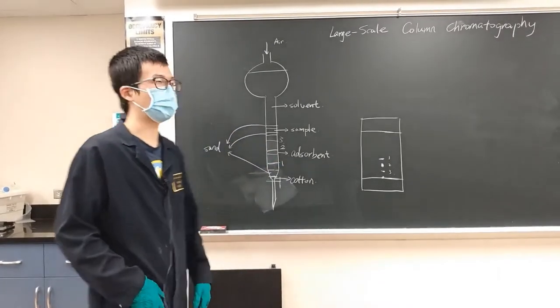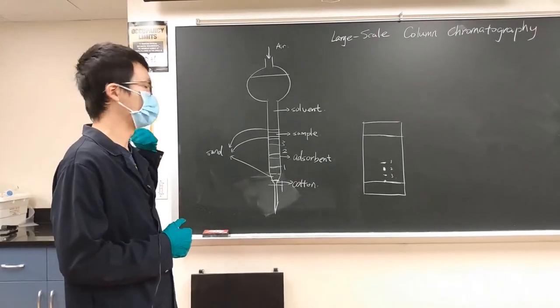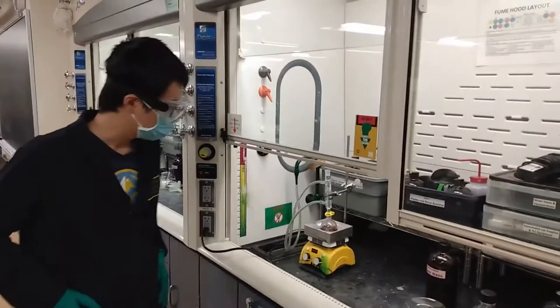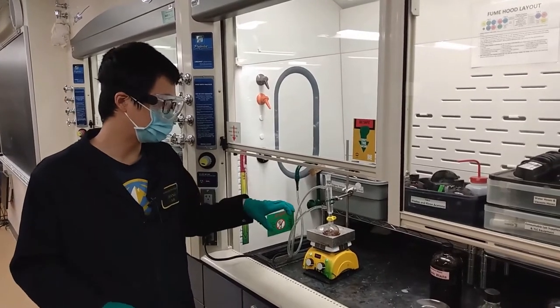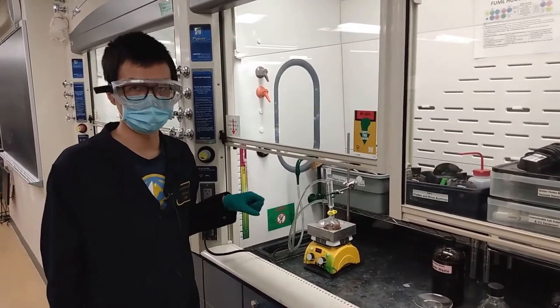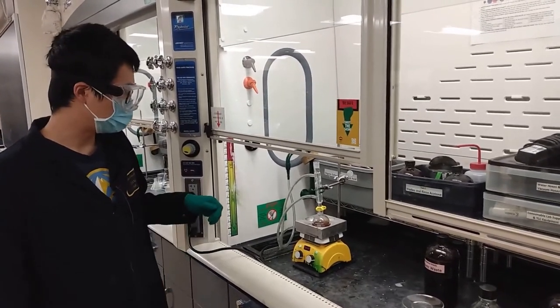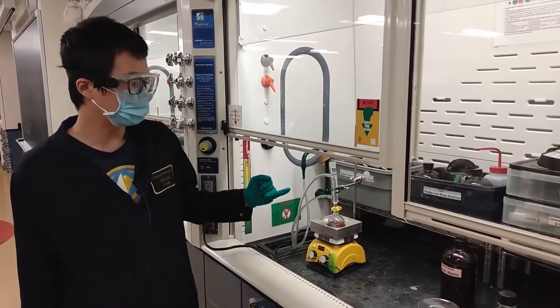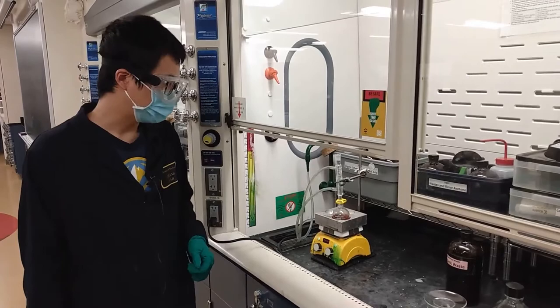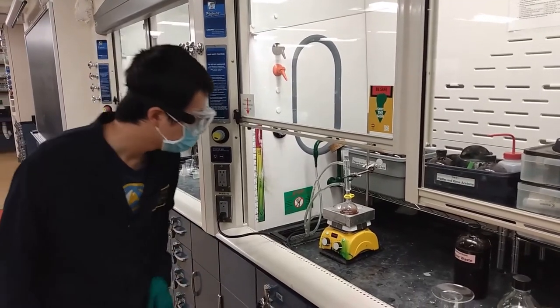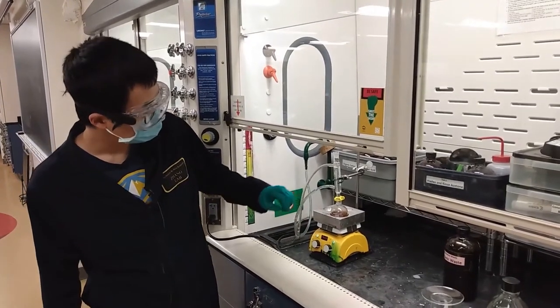The first step of this experiment is to reflux the paprika in DCM. The setup looks like this. Pay attention that the water flow will go in from the bottom and go out from the top. When you're heating up, try not to let the refluxing line go up too high.